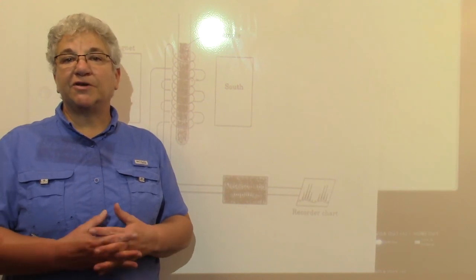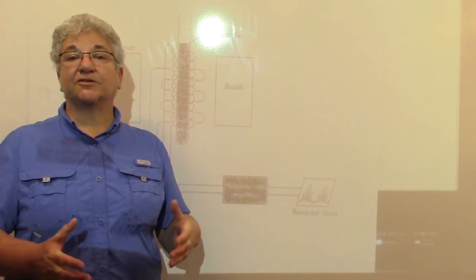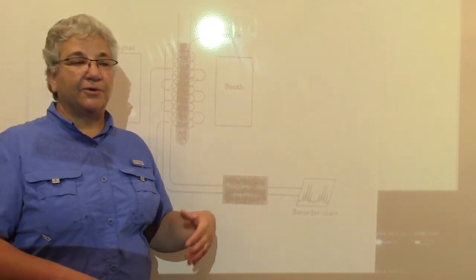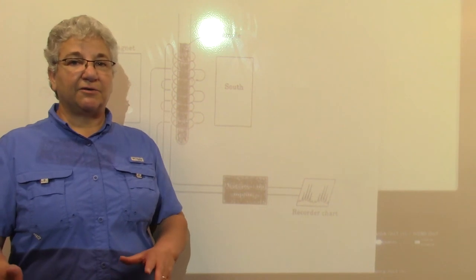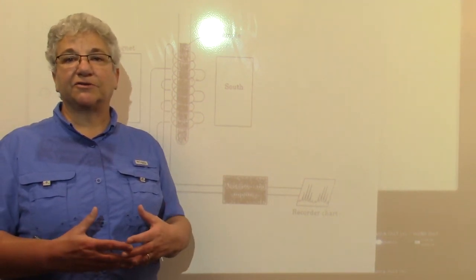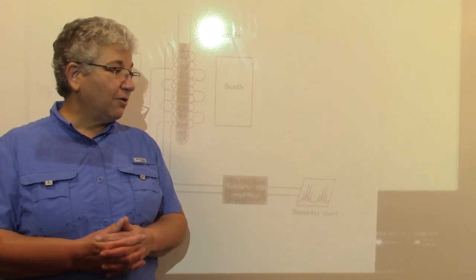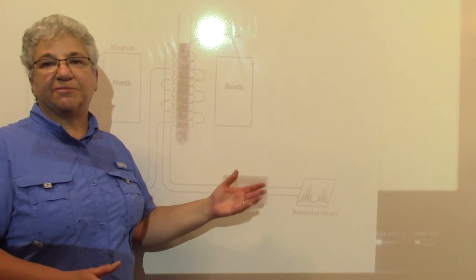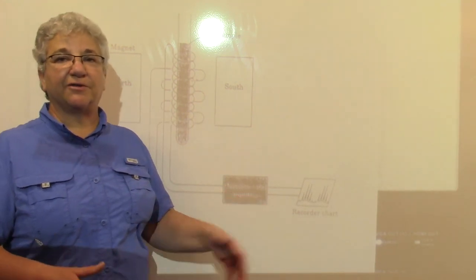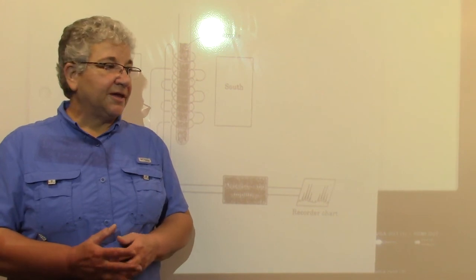You also had reading from Fessenden, and Feist, and reading from your actual textbook. And so I'm going to be going between the handouts that you have and then maybe drawing a couple of extra problems on the board for you. So I know that this diagram itself might be hard to see, but this is really just the schematic of the NMR that is in your textbook, so you could find it there if you wanted to.